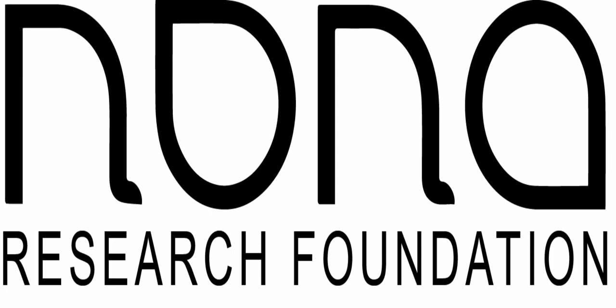And so this is someone with a very specific set of skills, who really thoroughly understood all of the regulations around a CLIA lab certification. So there's tons of it on the science side. Then on the LIMS side, you also have to include a lot of documentation about how your software is behaving and maintaining chain of custody, delivering results the way they need to be delivered, all of that. So they weren't lawyers. It's more someone who has experience with that CLIA certification process, as it is a process. And so looping those folks in as quickly as possible, I think, is really critical to the success there.